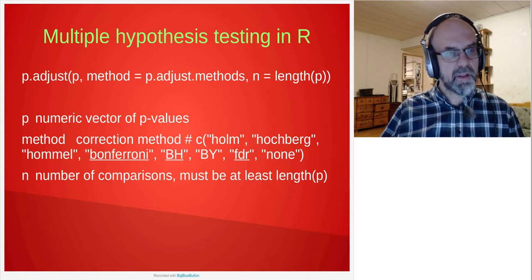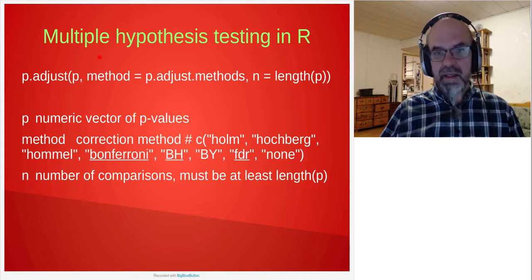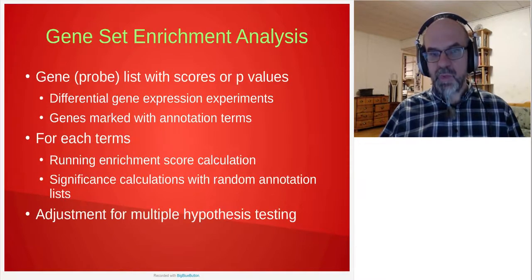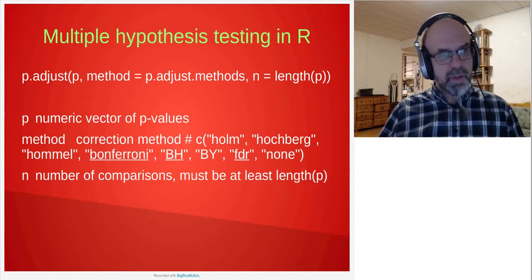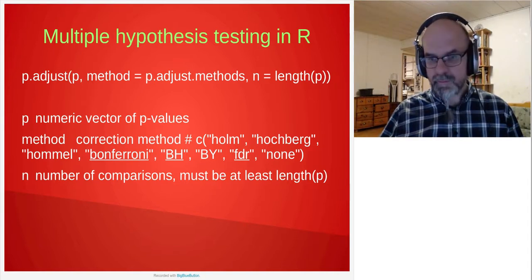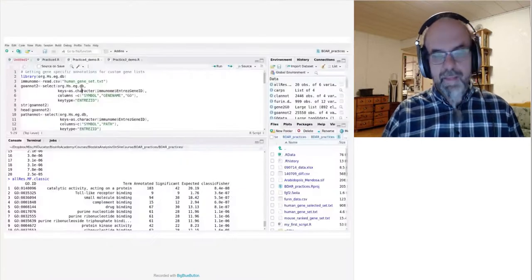I will show you a demo of exactly how to do overrepresentation analysis using R. So I will share my screen. RStudio, yes. Yeah, it's visible.